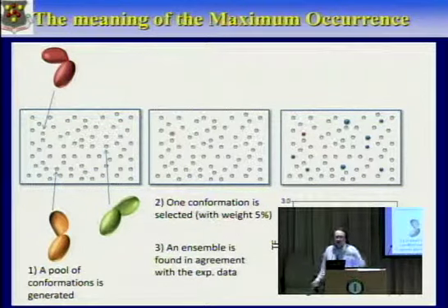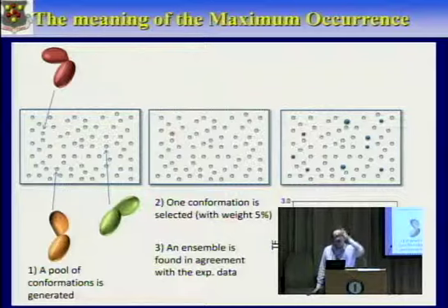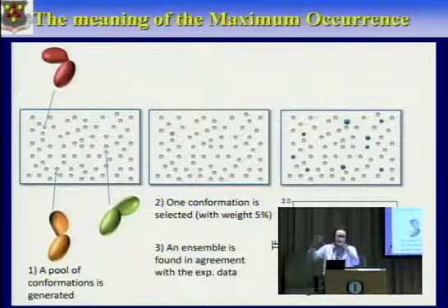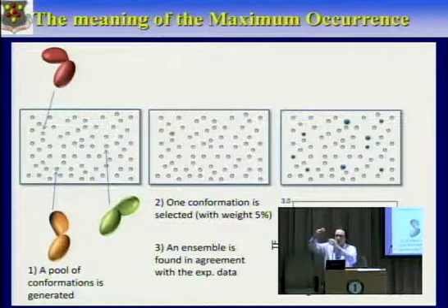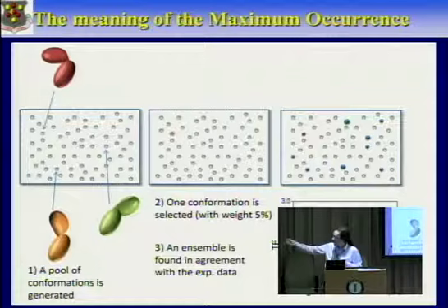As I said, this is done using the software from the SACS people, where we model the linker. If you model the linker randomly, you end up with a number of different configurations. The structure of the domains is fixed, the structure of the linker is changing, and so you get these different shapes.